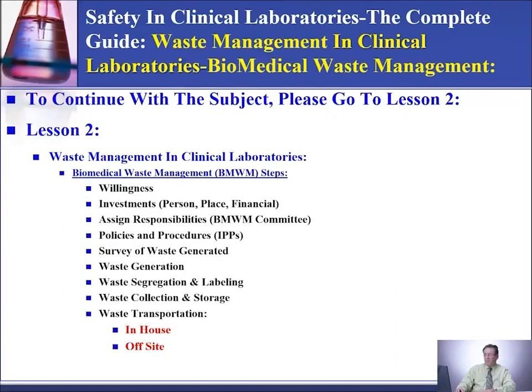I am done with lesson 1 on biomedical waste management in clinical laboratories. To continue with the subject, please go to lesson 2. In lesson 2, we'll talk about biomedical waste management steps, which are willingness, investment, assigning responsibilities, policies and procedures, survey of waste generated, waste generation, waste segregation and labeling, waste collection and storage, waste transportation in-house and off-site. Thank you very much for watching.